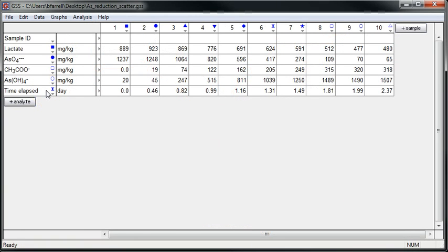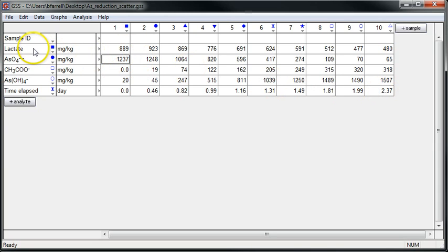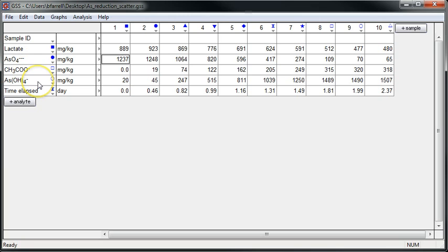Here I have a GSS spreadsheet with sampling points from an arsenate reduction experiment. As you can see, the samples are arranged chronologically in order from the beginning of the experiment to its completion. We see initially high concentrations of the reactant species, lactate, the electron donor, and arsenate, the electron acceptor. With time, the bacteria metabolizes these to form acetate and arsenite.